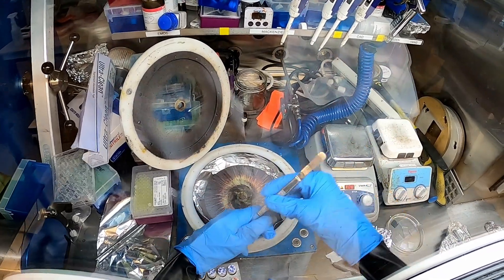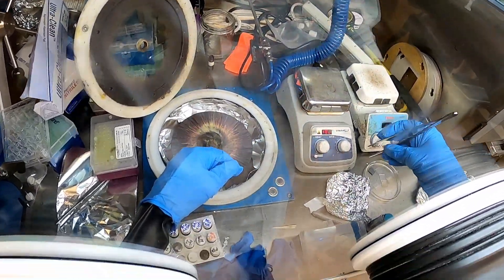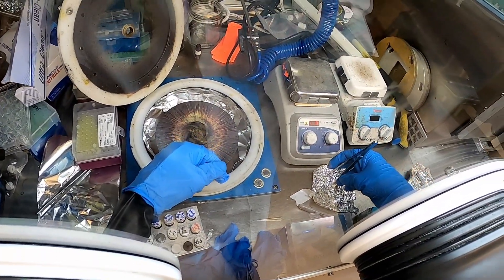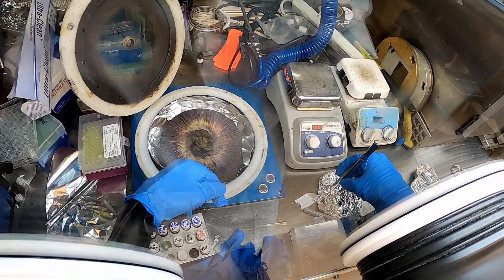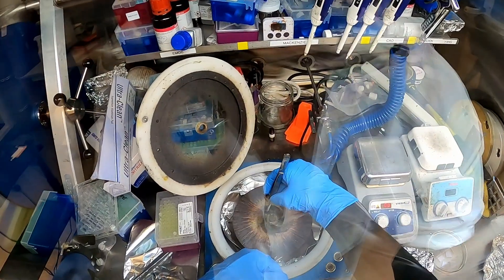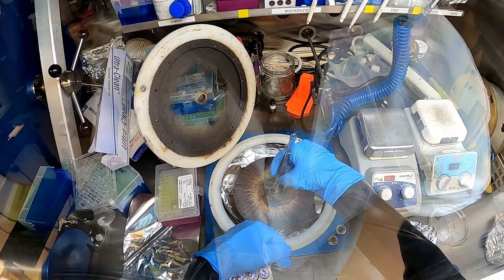After completing the dry run, we'll begin spin coating perovskite films. First we'll place a glass ITO substrate onto the chuck, turn on the vacuum, and then adjust the volume of the pipettor as needed.